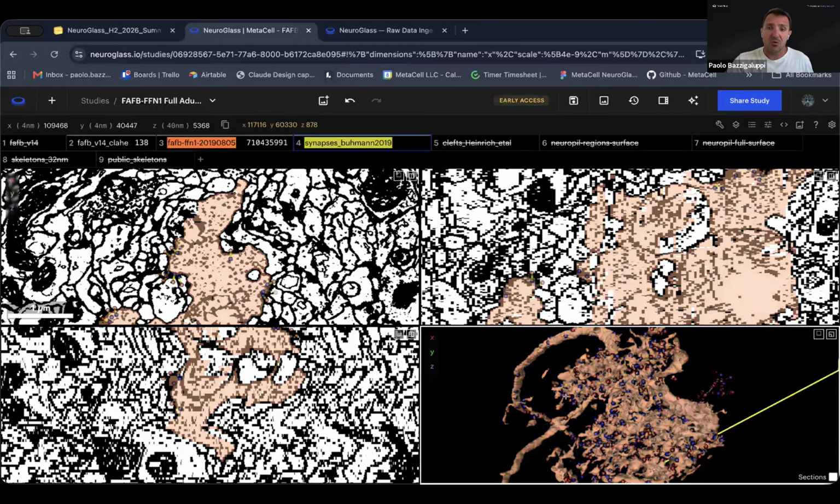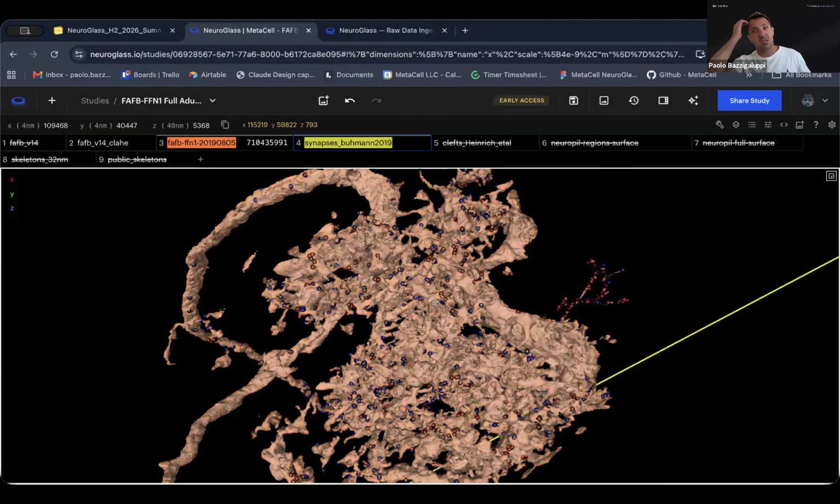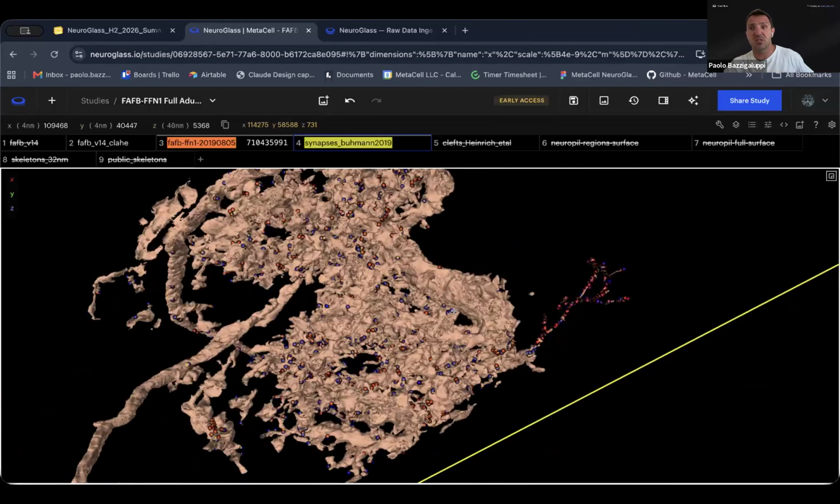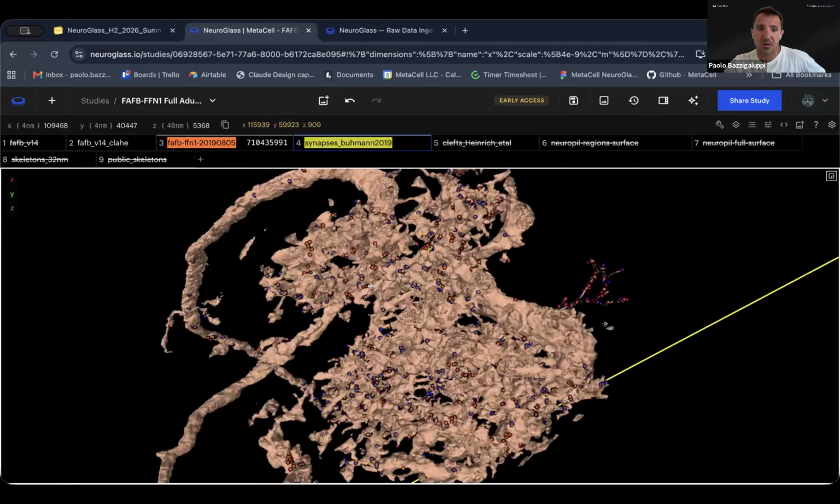After that, we're also going to focus on collaborative annotation. These annotations, as you see them on screen, are presented as yet another layer on your skeleton, and they will be able to be created directly inside the app.